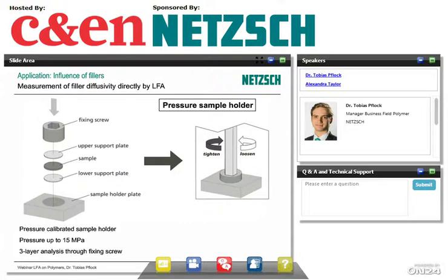How sensitive is the measurement regarding the detection of delamination in a multi-layer stack? Delamination is actually quite easy to detect because materials generally conduct heat much better than air. Air is insulating for heat transport.